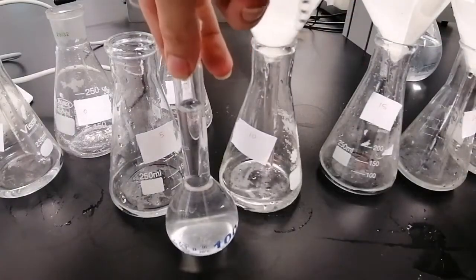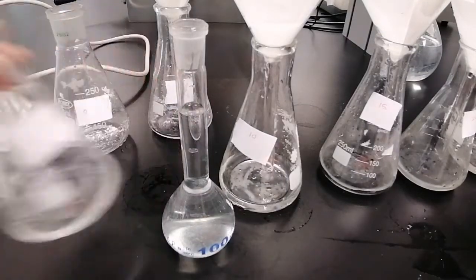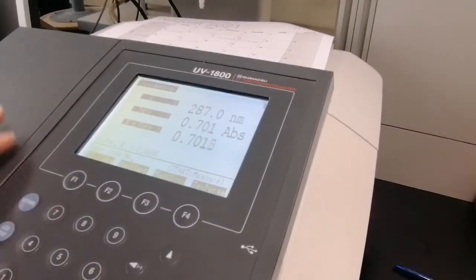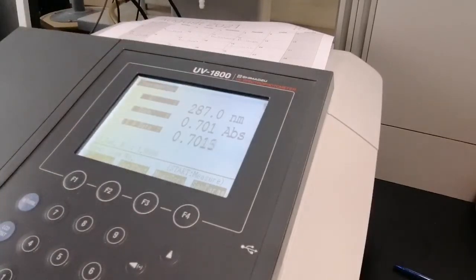This is the 0 concentration of ethanol, filled up to volume with sodium hydroxide, and now we are filling the second solution, which is 5% or 5 ml of ethanol in 45 ml of phosphate buffer with 0.1 gram of mefenamic acid. The blank. Okay, and now this is the absorbance of the sample of mefenamic acid with phosphate and ethanol diluted with sodium hydroxide. We put the blank of ethanol and phosphate buffer and auto-zeroed on it at the same lambda we used before, and then we start testing the absorbance of the different samples with different ethanol and phosphate buffer concentrations.